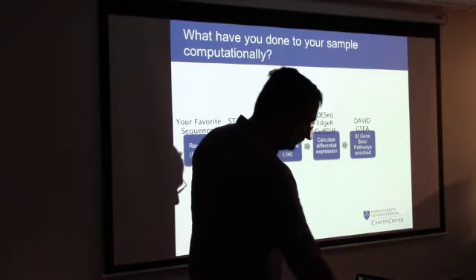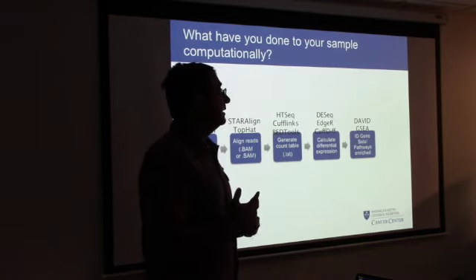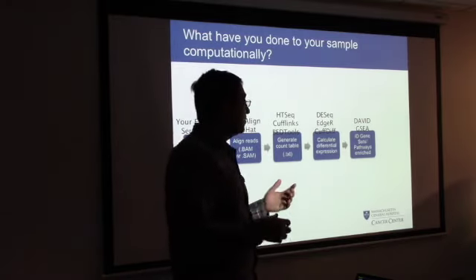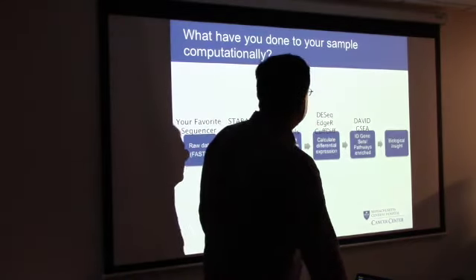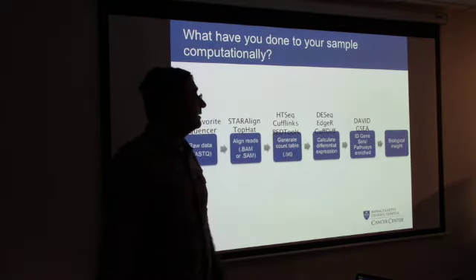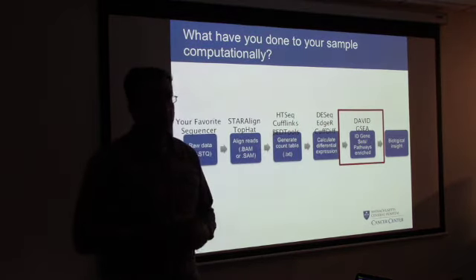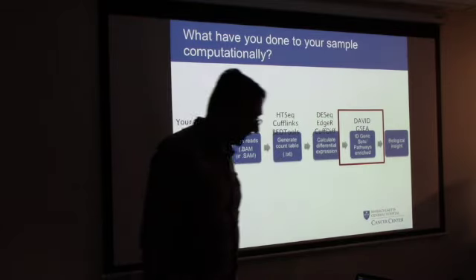At which point now we're ready to look at our data set and look at gene sets and pass them through this software called DAVID or GSEA and figure out what pathways are enriched in our data set. All right? And then that should lead to the final step, which is biological insight. So I help you all the way till DAVID and GSEA. The biological insight part is all you. That's where the ball comes back to you. It's in your court, and you take it from there.